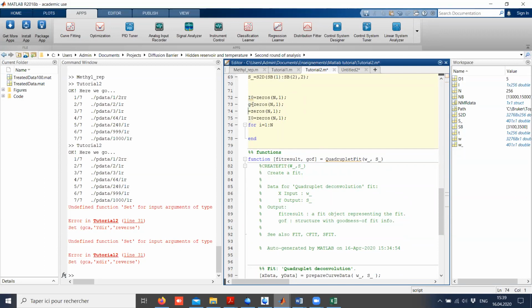As I told you last week, I always prefer to define my variables before I use them. You may have already said this, but just to ask, if you define all of these variables, so basically the size of these vectors, before you fit, does this limit or control the number of iterations of the fitting? Doing this, you mean? Yeah. This is only to have control over, it's just a habit. So let's do this. I comment it so that it's not active. You will see what MATLAB tells me, and I'll come back to your question in a minute.